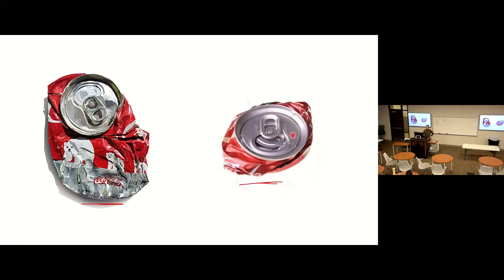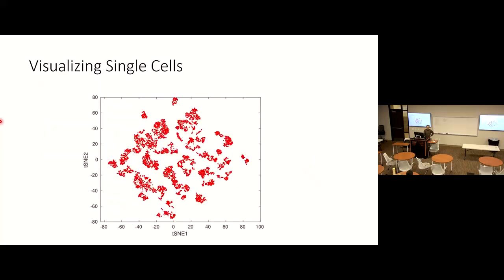They're all the same object, but the lower dimensionality representation may look very different if you use a different technique. So that's why we need to know different techniques, see what the outcome is, what the principle behind it is, and which one we should use in single cell data analysis.